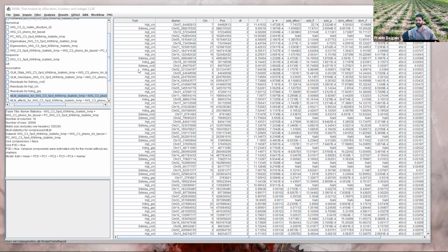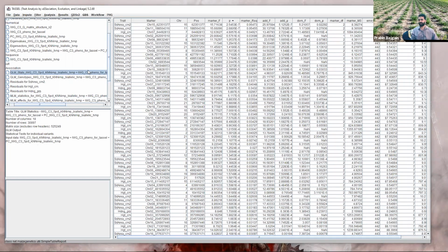Next, I want to talk about the p-values here. In TASSEL, I do not think you can correct the p-values for a false discovery rate or a Bonferroni method, as you might have heard. What you can do is export the output table, and in R, if you just search for an R package for Bonferroni or FDR correction, a few will pop up. You can import the data and, based on the size of your data set, correct for any inflated p-values, and then report the ones that come out as significant.